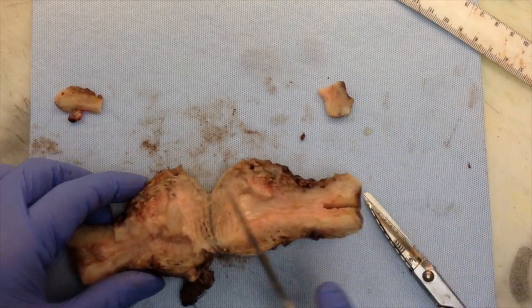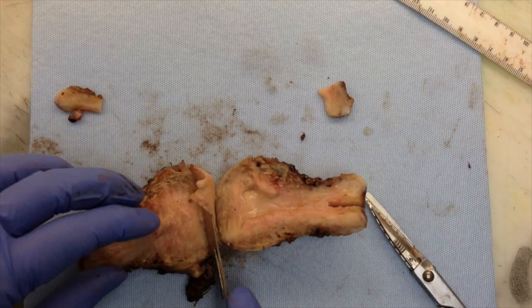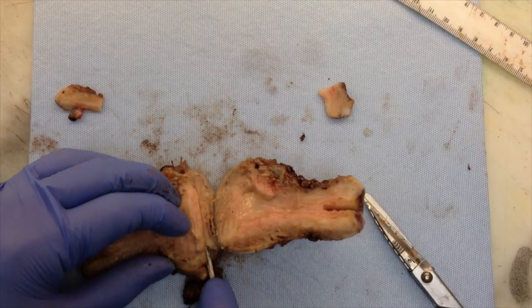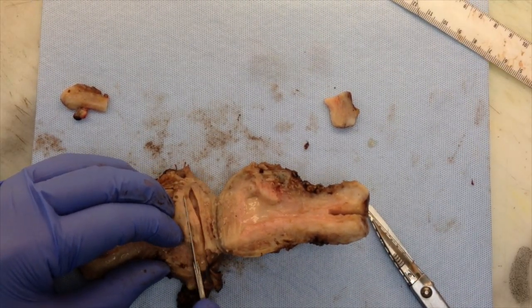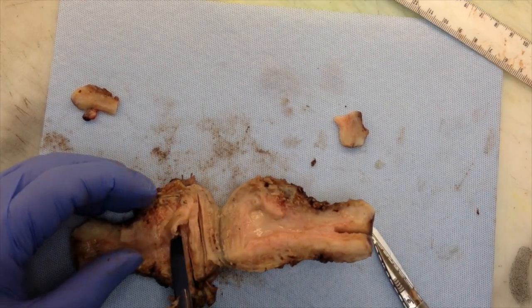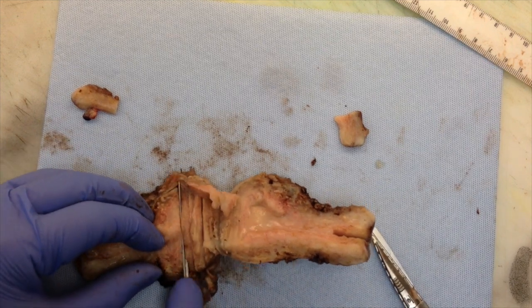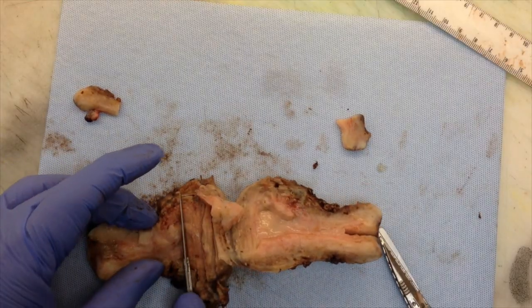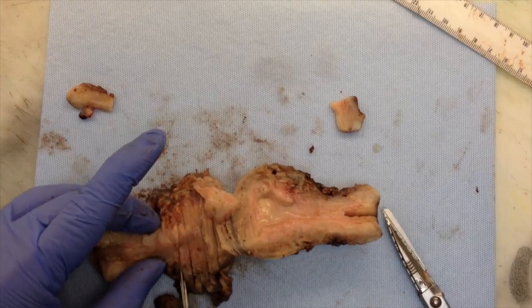And the next thing I do is cut it, serially section it like this, and I like to leave it attached. So this is some endometrium I'm going to move to the side, and I like to leave it attached at the end here, just so it's not in a bunch of pieces, and it could still be put together if need be.